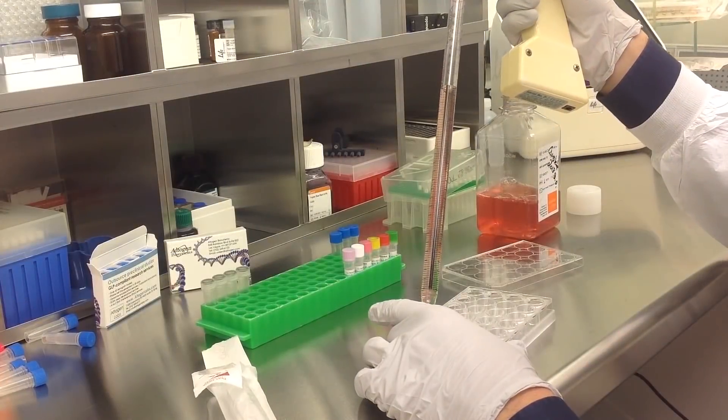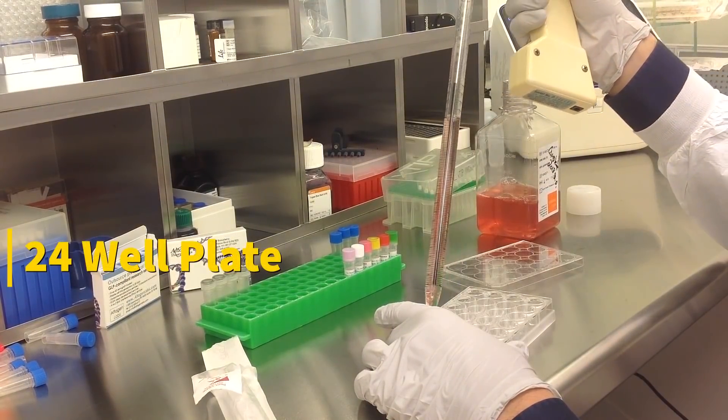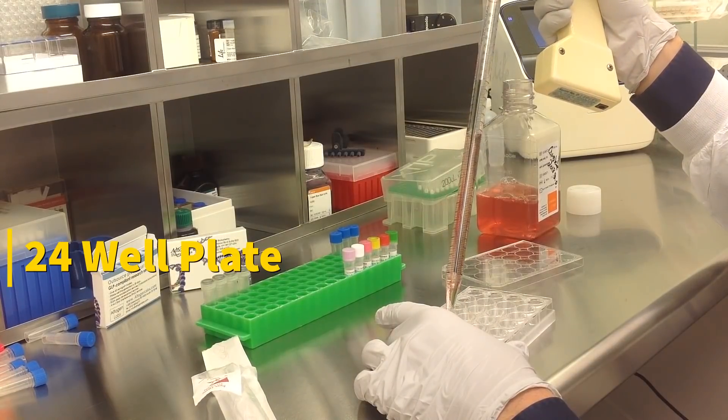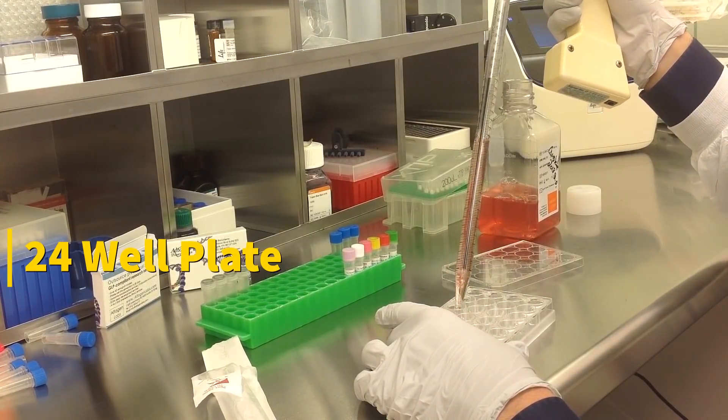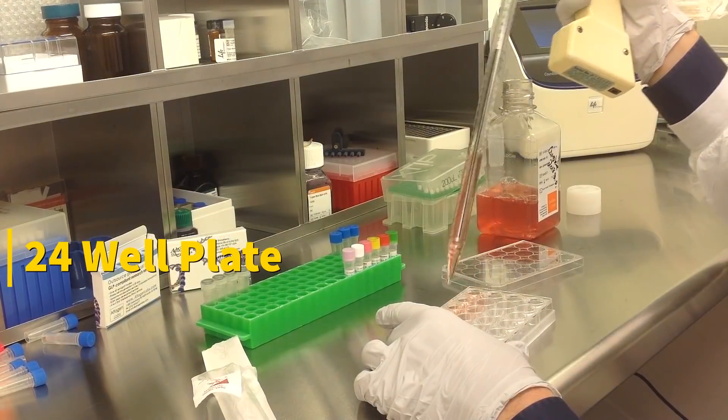Today we'll be transfecting HEP3B cells obtained from ATCC. We will be using a transfection kit manufactured by Altogen BioSystems. In this tutorial, we use a 24-well plate. Transfections can be scaled up or down based on plate surface area as described in the corresponding transfection protocol, which can be found at altogen.com.